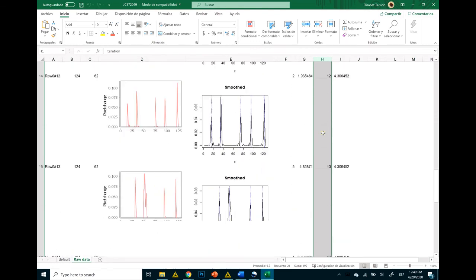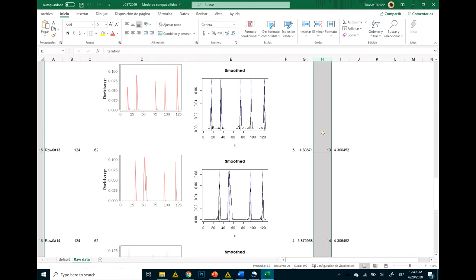So that will be all for the tutorial showing you how to analyze the spontaneous coilings in zebrafish using the KNIME workflow.